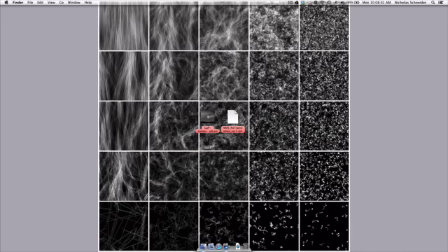Hello, this is Nick Schneider and I'm going to go over a macro I wrote in ImageJ in order to correct a video sequence for translation.